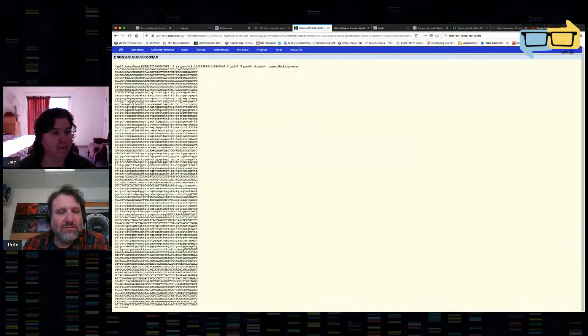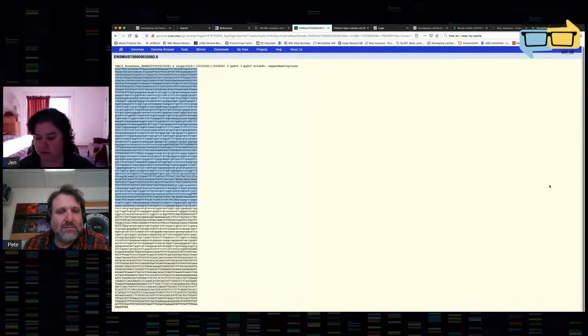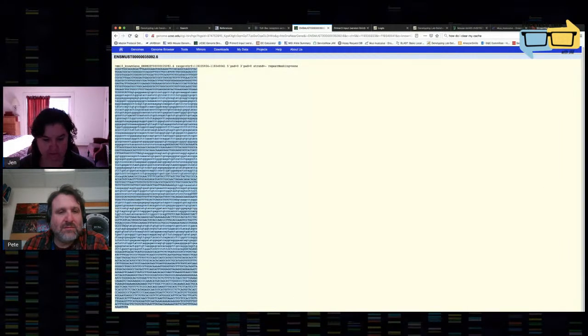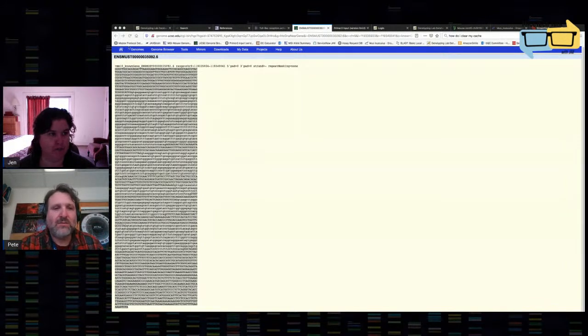I'm going to grab the sequence and put it into my favorite program, which is called Gene Construction Kit. You don't have to use Gene Construction Kit — other programs that people use are Sequencher and SnapGene, for example.